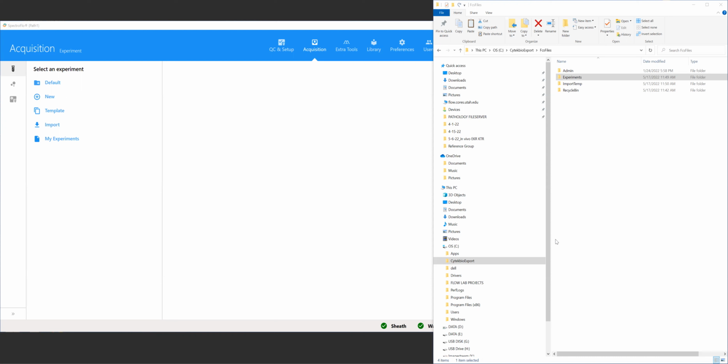So with that in mind, there's a few different options for exporting data, depending on whether or not you plan to repeat experiments. The first option is what you will be the most familiar with. And this is mostly going to apply in the cases when you don't plan to repeat an experiment. This is really the only thing you'll need to do.